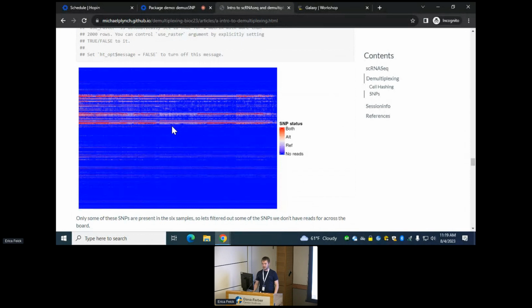In practice, it's much, much harder to do. First off, we're looking at single cell RNA sequencing and short reads. This creates a lot of problems. This kind of experiment isn't designed for good SNP calling. However, we hope here to just be able to get enough SNP information to figure out which group each cell came from. So this is really, really hard to decipher, right? Very sparse and not a lot of signal.